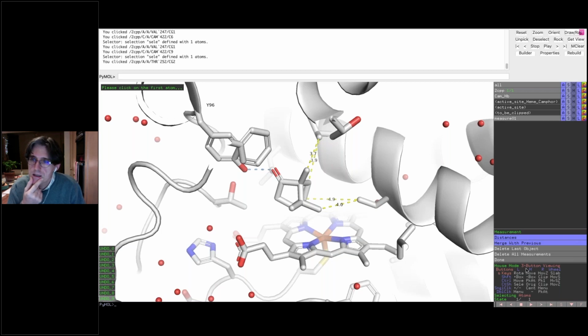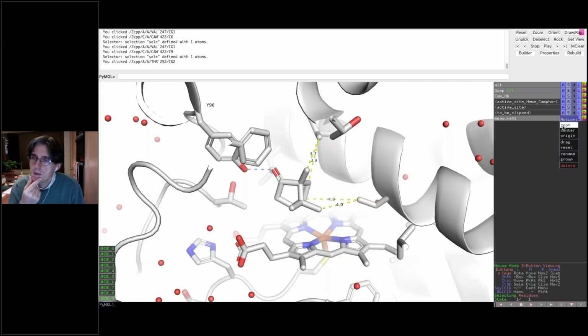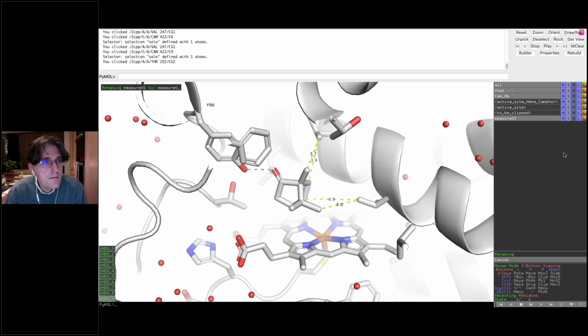So let's say we're done. That object is called measure01. Let's rename it to something more meaningful. Oops, sorry, I hit reset. Rename. We could call that hydrophobic contacts.